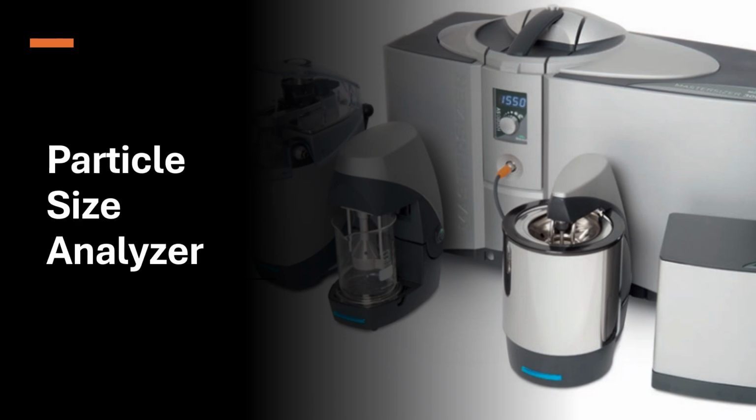Today we will discuss the particle size analyzer. Particle size analyzers are essential instruments used in laboratories and production facilities to measure the size distribution of particles in a sample. Basically, these analyzers help to ensure product quality, consistency and performance, especially in industries like pharmaceutical, chemical, food and material sciences, right? So let's start.